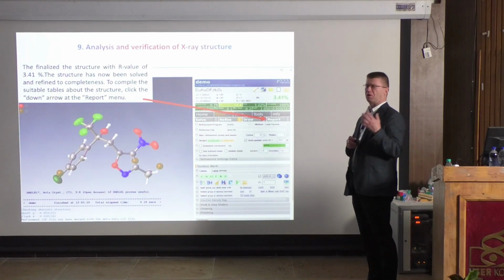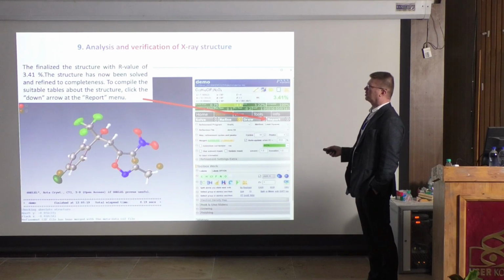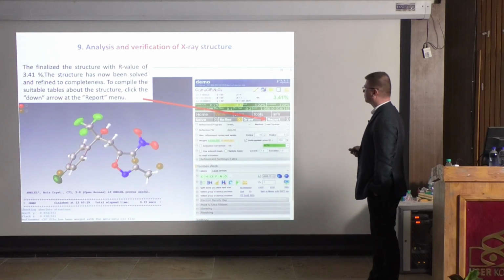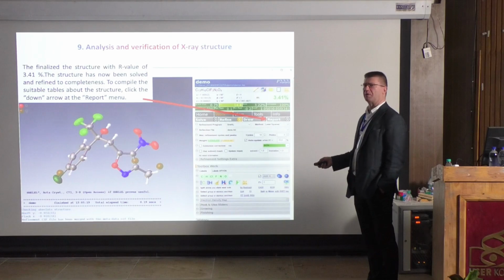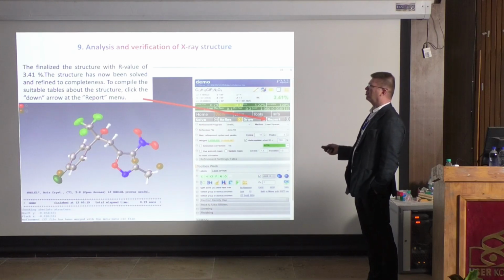So what do we do after we have done the X-ray structure? Now the finalized X-ray structure, which we are happy with, is there. Everything has gone green. You can see here, all the atoms are correct. And now we know that these 3 peaks here are background. We don't have to worry about them, so everything is fine. And now we have to do what we normally do. We make tables out of it. We call them crystallography tables.